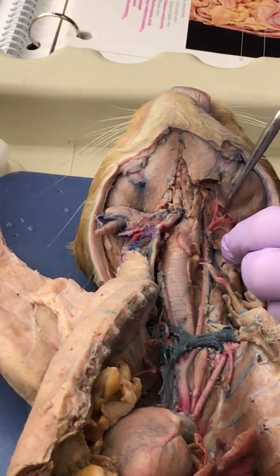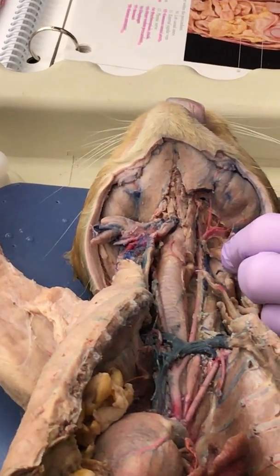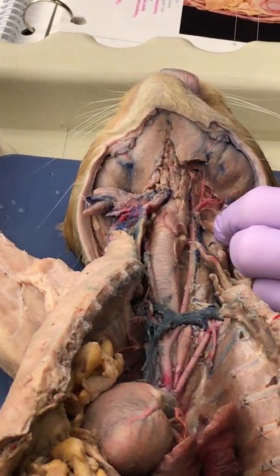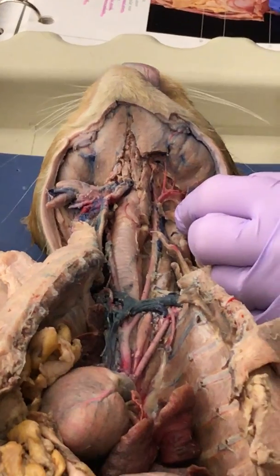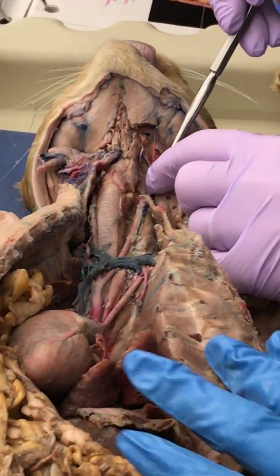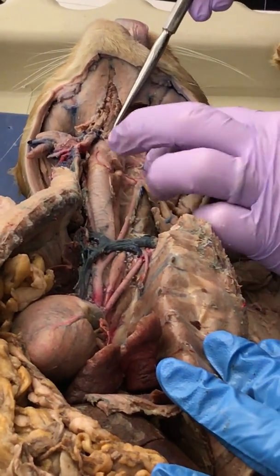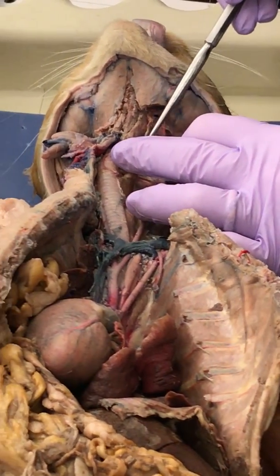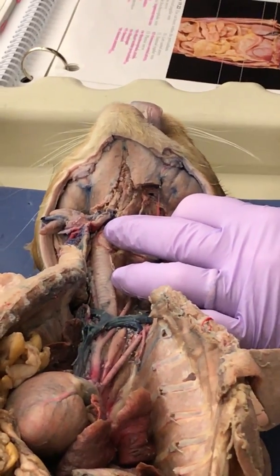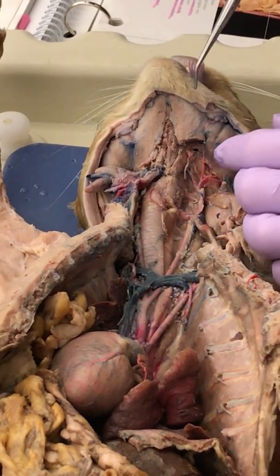I don't know that one. You had said last time that it was weird that it had an extra. Did I say that? Yeah. So I don't know. Where's the laryngeal? Okay, so you still have it. Oh, good. It's covered. Yes, it's got connective tissue. All right. So I got those two. You do have it. Laryngeal. Yeah, you still have it.